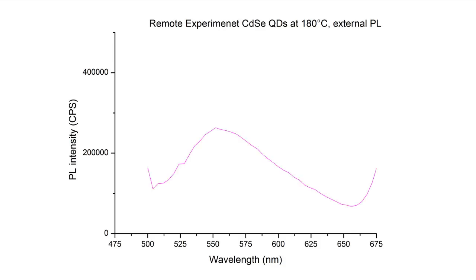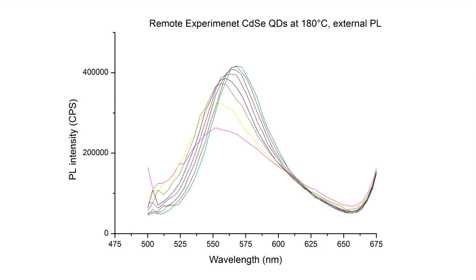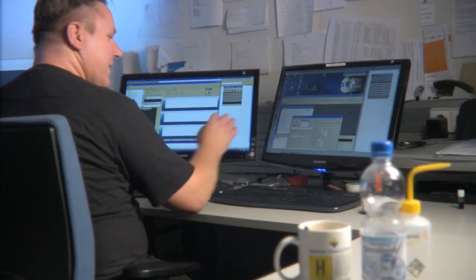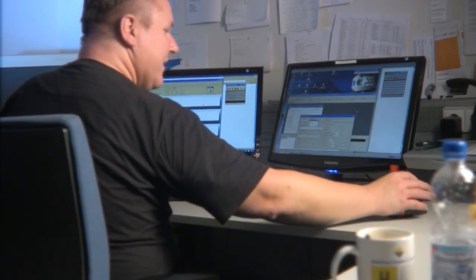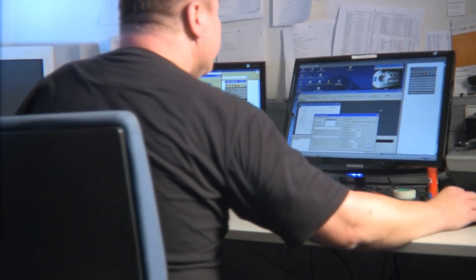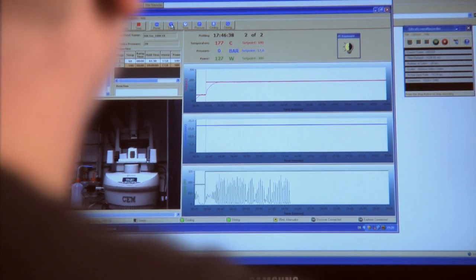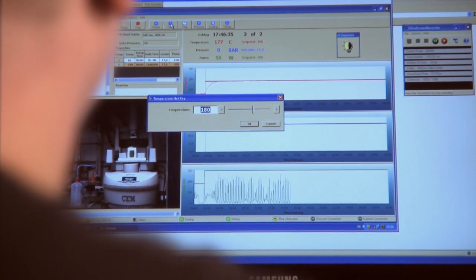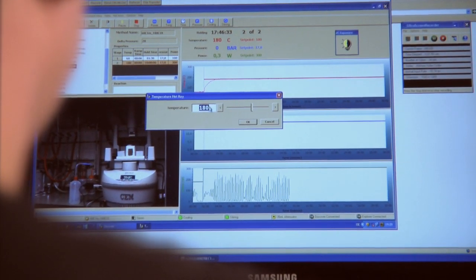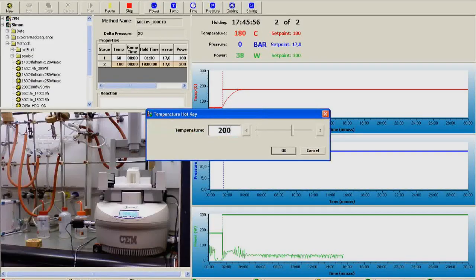The immediately available results enable detection and potential intervention during the synthesis, which is an important requirement for the remote control of experiments from outside the laboratory. Here, an increase of the temperature set point leads to an enhanced reaction rate.